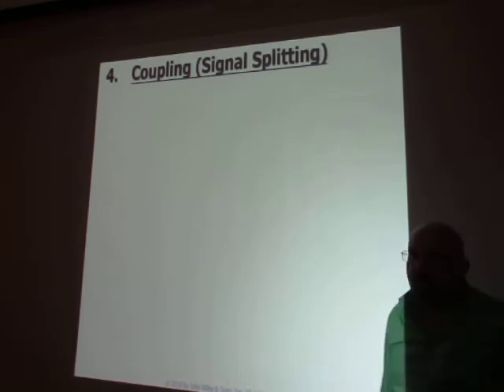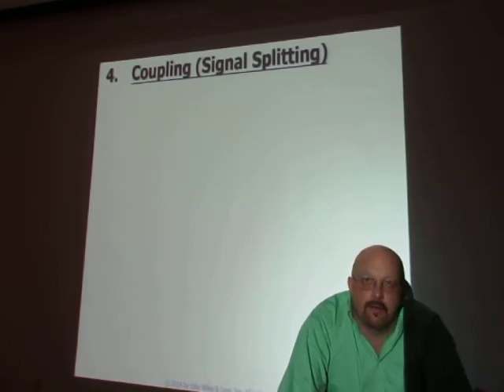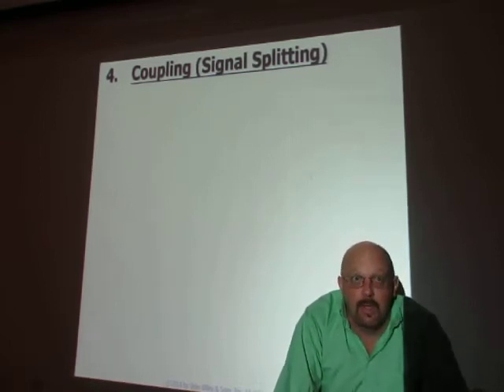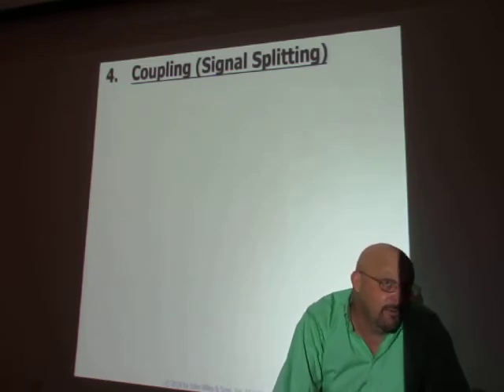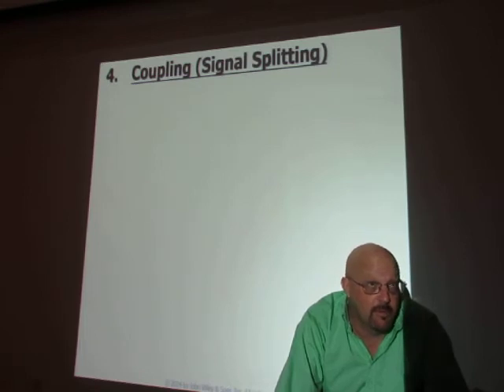Okay, any questions on the integration? That integration is important. Look at the integration, please. So like I said, if it's integrating for 2 protons, I'm going to guess it's a CH2 group. Integrating for 3, I'm going to guess it's a CH3 group. Integrating for 6, I'm going to guess it's 2 equivalent CH3s. Could be 3 equivalent CH2s, that would get me to 6. But that's pretty tough to have 3 equivalent CH2s. More than likely it's 2 equivalent CH3s.